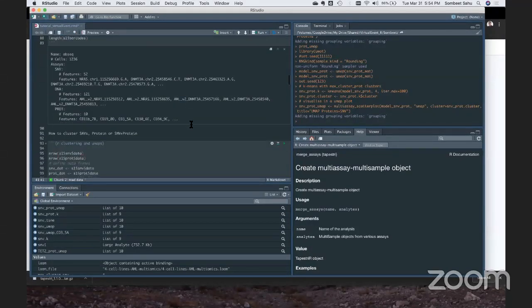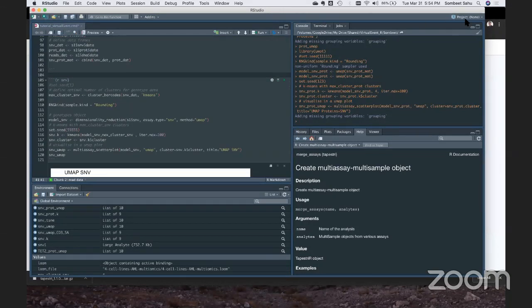Yeah, and there was another question in the Q&A. On top of the number of clusters, when you compare clustering patterns on different samples, does a different location of clusters of the same color have any biological meaning?